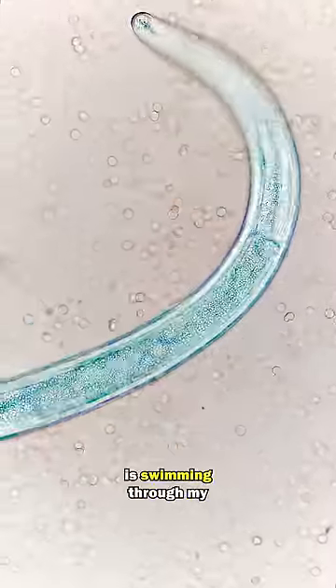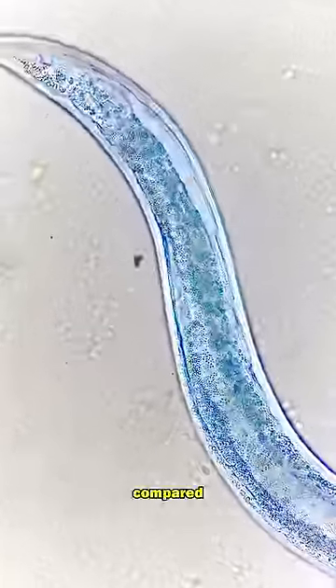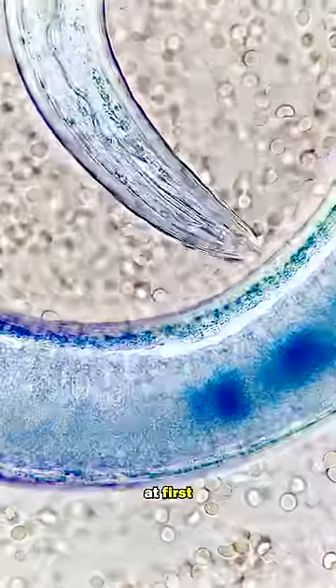This blue worm here is swimming through my blood cells. And it is massive compared to my blood cells. Nothing happened at first, but then I noticed something incredible.